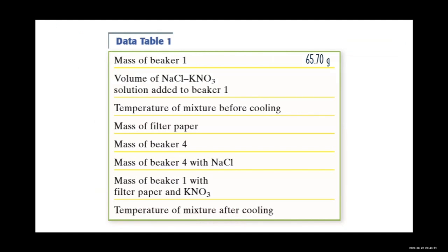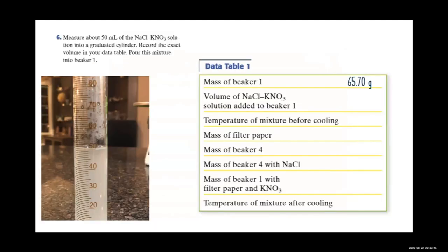Our mass for beaker 1 was 65.70 grams. Measure about 50 mL of the sodium chloride–potassium nitrate solution into a graduated cylinder, record the exact volume, and pour the mixture into beaker 1. We got exactly 50 mL.